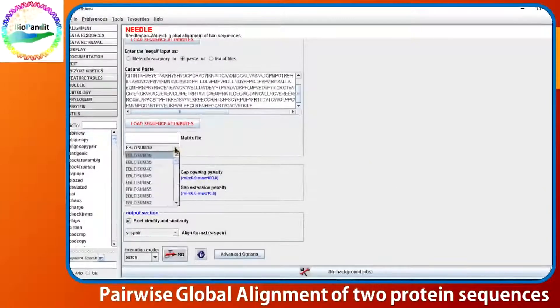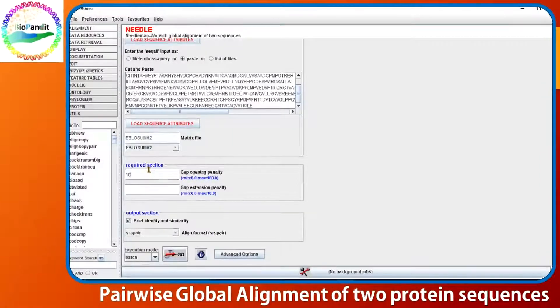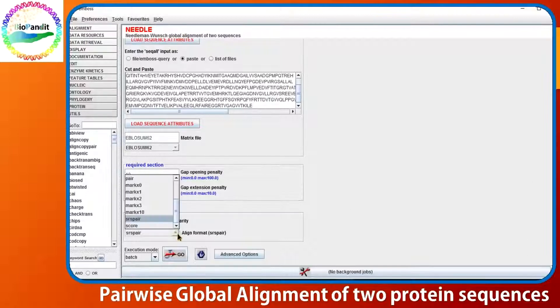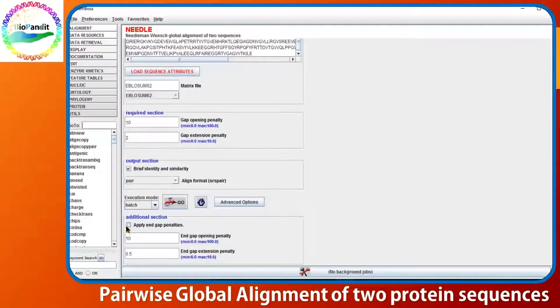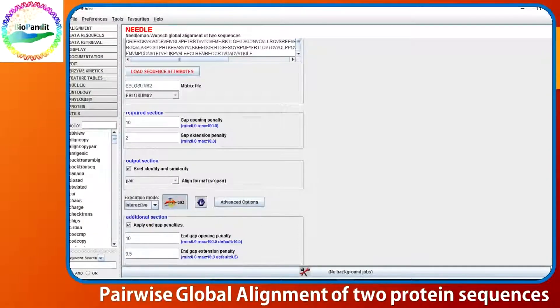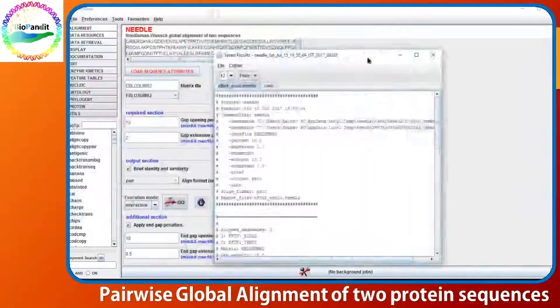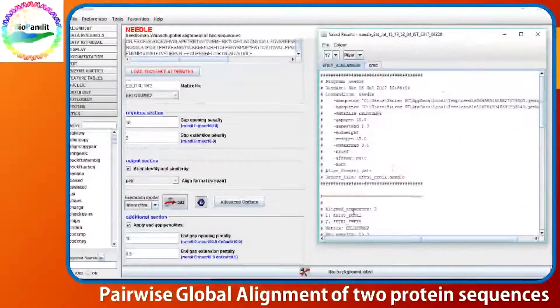Then, you simply select your substitution matrix file, gap opening and gap extension penalties. Set the execution mode to interactive and hit the go button. A new window has appeared with your alignment.